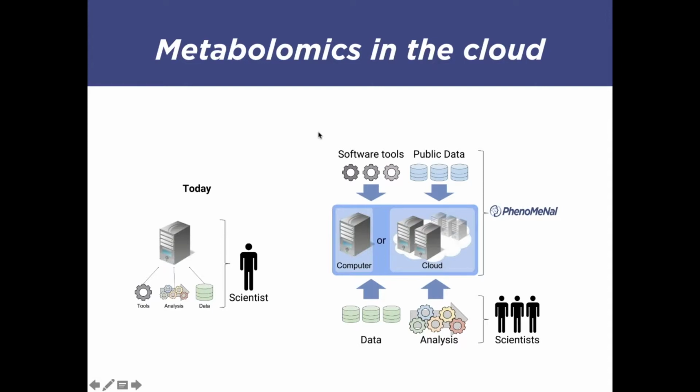So our proposal in PhenoMeNal is to enable you to run your analysis with the same tools, the same workflow analysis environments, being able to access the same data, but on an automated setup that you can deploy on the cloud so that you can scale very easily. So you can use a few computers if you have a small analysis to run, but you can use many, many computers if needed.